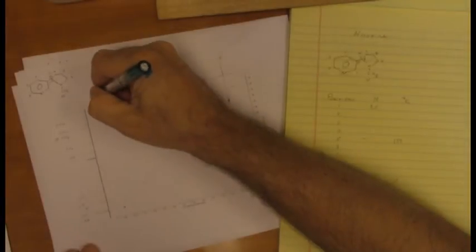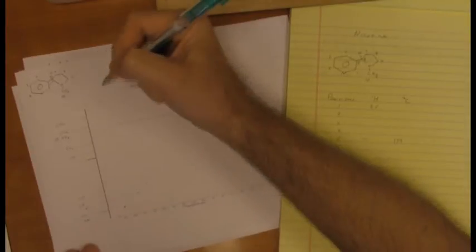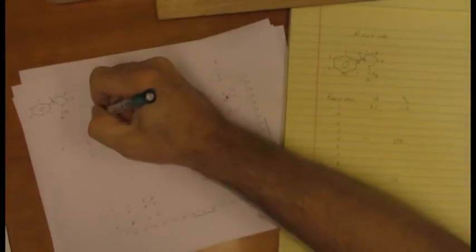So I think this is decent evidence that that is position 1 in the proton, and this one right here is position 1 in the carbon spectra. That puts carbon at position 1 at approximately 152 ppm.